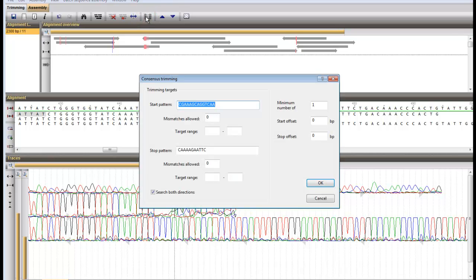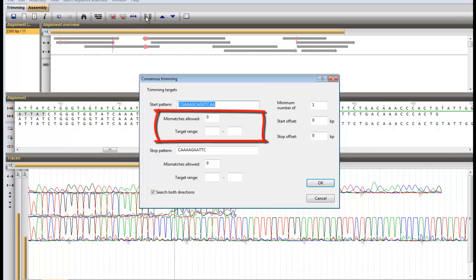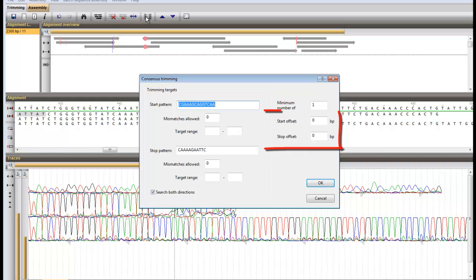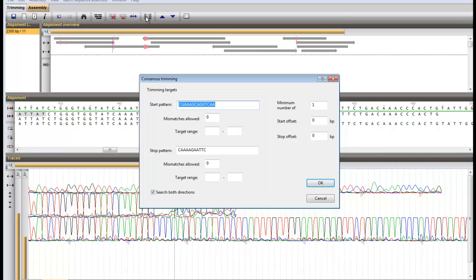You have a choice to allow mismatches and specify a target range in which the trimming site should be found. The number stated in the offset boxes indicates the amount of base pairs to be trimmed off the target.